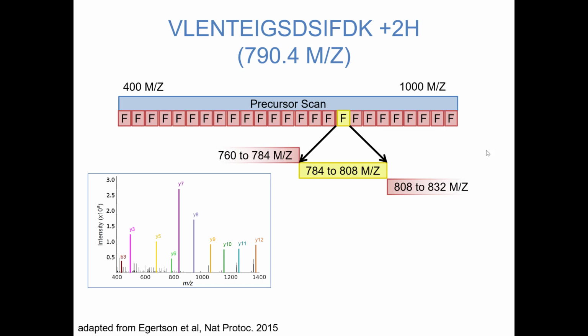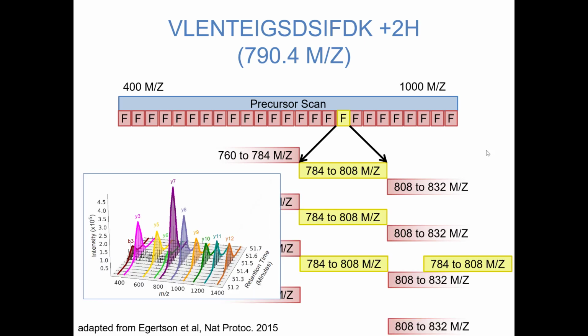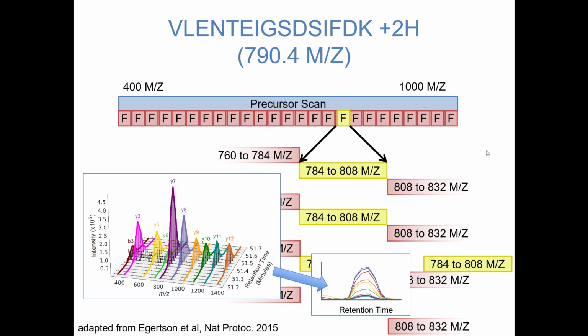And here, if you looked at one of these scans, if there was a really high abundant peptide, it would look something like this. If you were to look across these multiple scans, it would look like a stacked chromatogram, basically, and you could look at it from that perspective. The idea was that instead of trying to analyze any one of these scans individually, you could just look across this way and see all the fragment ions that you would extract out of these spectra, instead of all of the fragment ions that existed in these spectra. That simplified the interpretation quite a bit.